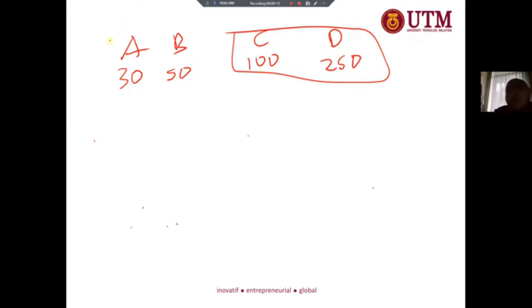Because the temperatures of A and B are not that different, I start with 50 degrees C and maintain it for about 2 minutes.